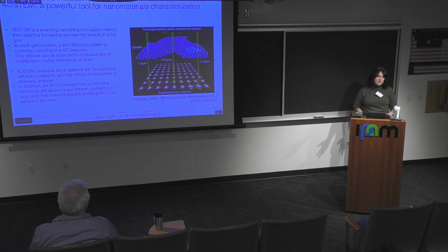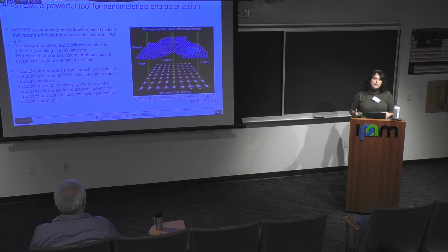So one might think, and this is a valid analysis method that can be really successful in some scenarios, that you could template match or compare to simulated diffraction patterns of a known material. This works great in a lot of scenarios, but not every scenario. And particularly in my group where we study complex synthesized materials, it's not always the best approach. So we would really like an approach that doesn't assume anything about our sample structure.